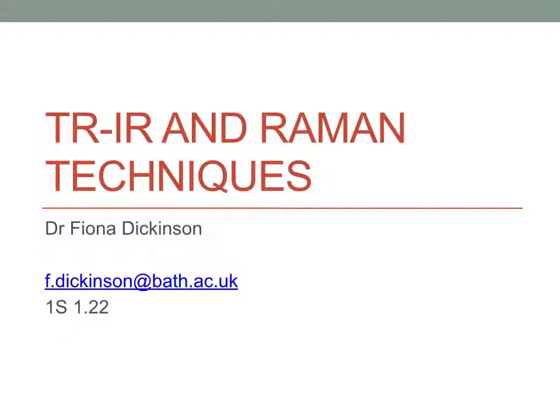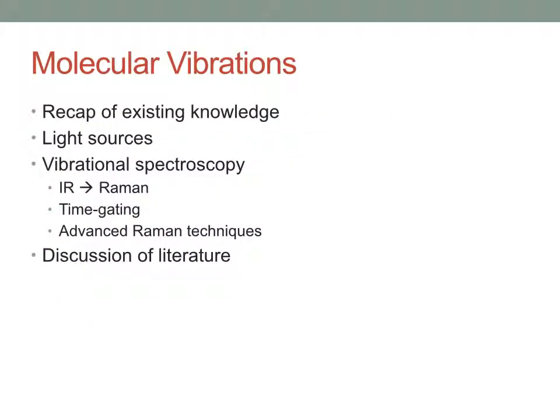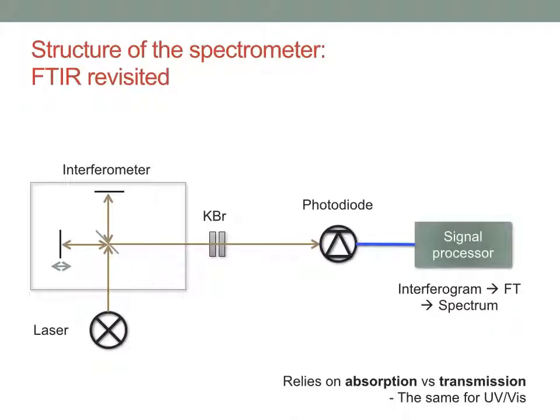So this is the very first stuff that I covered in the lecture last time, and I introduced you to infrared. And you've all used infrared before, and you've all seen Raman as part of your studies, whether that's with Steve Rosa in the second year, or somewhere else. Steve definitely covers Raman, and he talks about it from a rotational and vibrational point of view. But right here, I'm only interested in vibrational Raman.